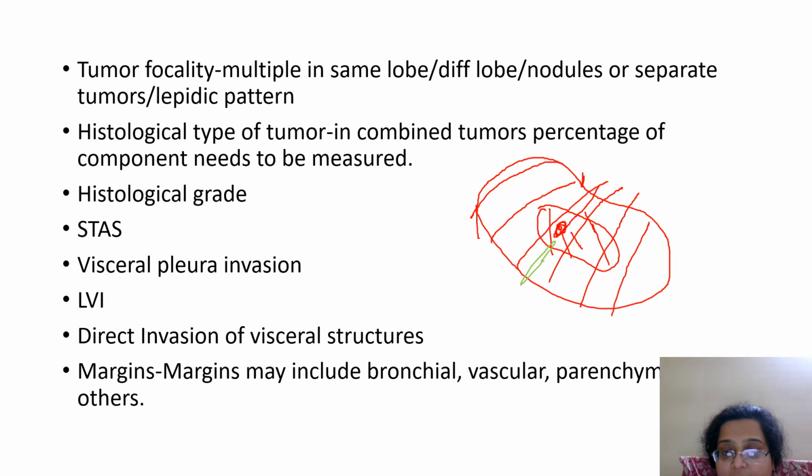I'll take this one slice, and then I'm going to take multiple sections from one slice, hence maintaining the orientation of the entire specimen received. And I'll also check the other slices for extra findings which I might be getting. If there is calcification, grittiness, variegation, then I take a section from there.